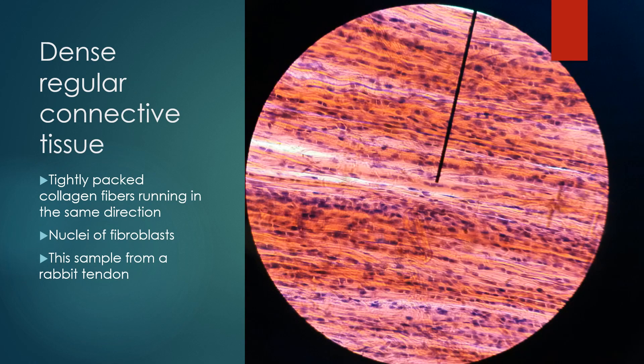Number five was dense regular connective tissue. What we see here are tightly packed collagen fibers that are running in the same direction. Notice there's very little space between all of these fibers. They're all running parallel to one another, and these are collagenous fibers. The nuclei that you see here belong to fibroblasts, which are the cells that produce these collagenous fibers. This particular sample was taken from a rabbit tendon.